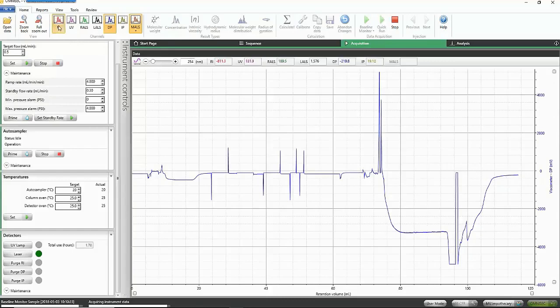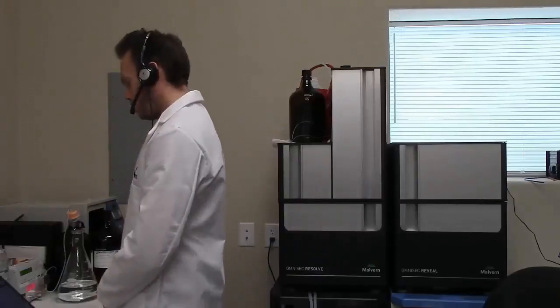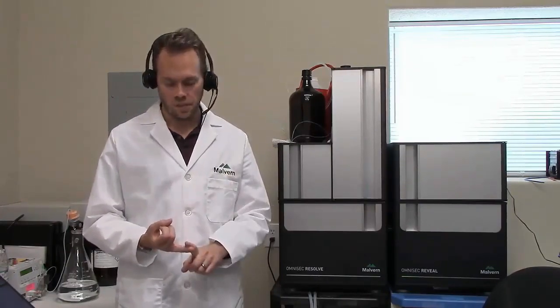So I haven't done any purging of the detectors yet, but in terms of the dangerous points of the solvent exchange, we are past those 2 points. We flushed all the salt out of the system, so there was no precipitation, no blockages, and the light scattering detector stayed clean when we moved from water to THF. So there was no salt precipitation, so that was one danger averted.